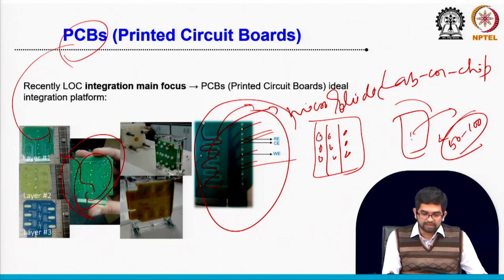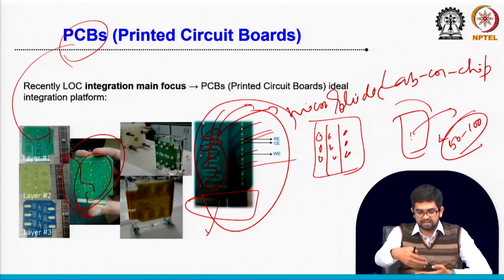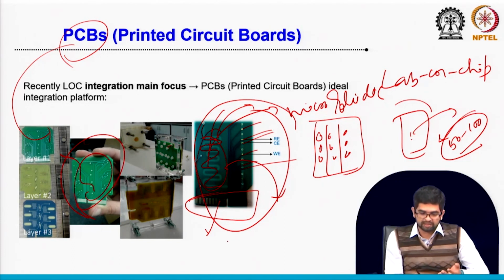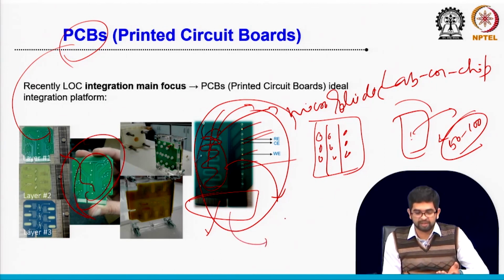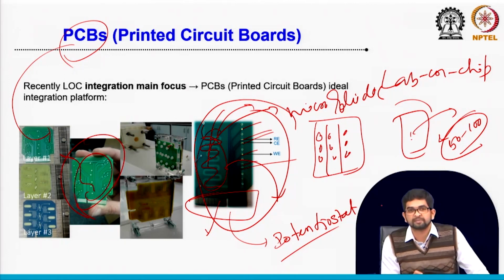That's why you can play around with the design here, and you can integrate this kind of microfluidics. And there is a connector. You can insert your chip into that connector, and then you can apply whatever potential or current you may need to apply by using a potentiostat. That's why we are saying the PCB is a very ideal platform for biosensor development.